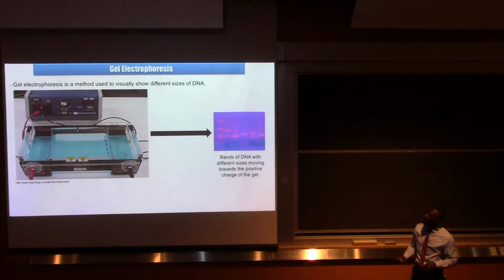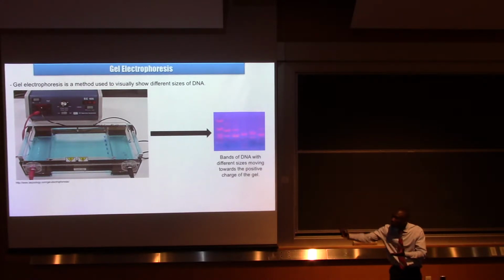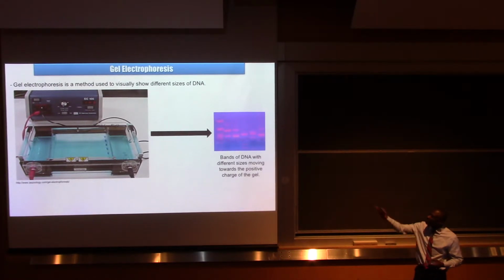After this polymerase chain reaction, it's impossible to use the naked eye to view whether the probe is specific or not. So we use another method called gel electrophoresis. This is where a charged molecule passes through a gel under electric current. In this method, if the probe is specific, we will see only one band on the gel. But if the probe is not specific, you will see more than one band on the gel.